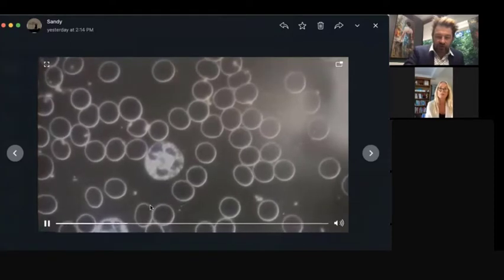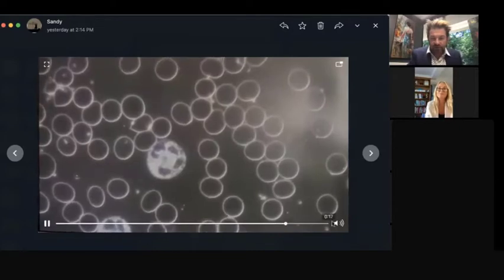So here is my blood. I'm going to take the audio off. So I did a little bit of an experiment. So this is your live blood. I think this was the first one.